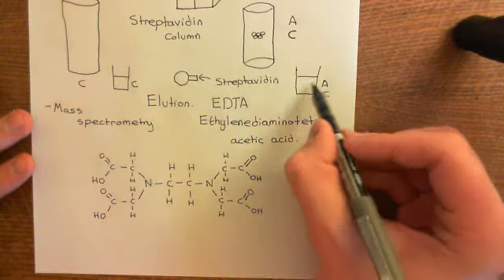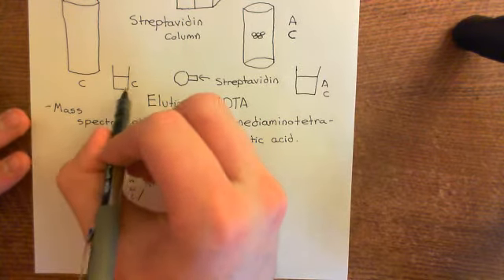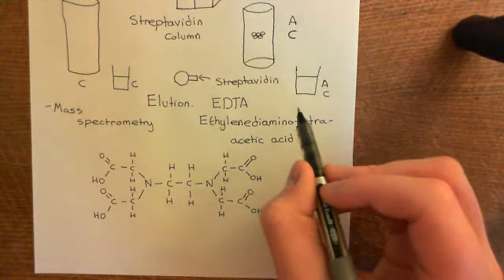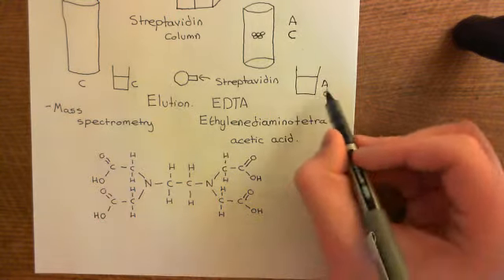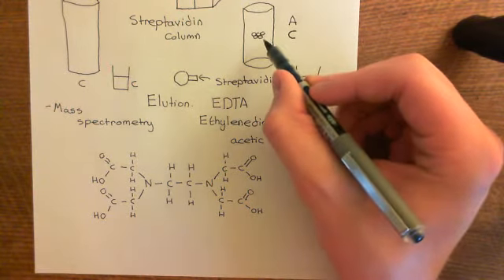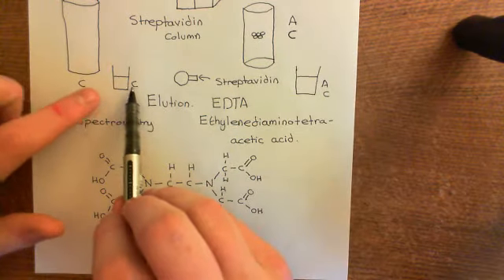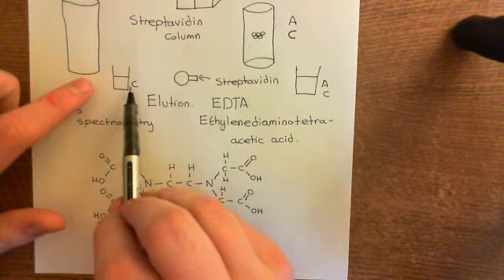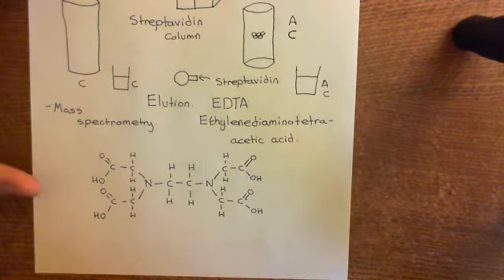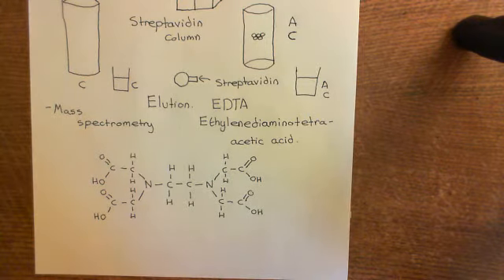So it's the ones that are present in here, subtract off the ones that are also present in here, that originally had palmitoyl groups on, because it is those that only bound to the beads because they had palmitoyl groups put on. So protein C bound to the beads whether it had the BMCC molecule stuck onto it or not, basically.